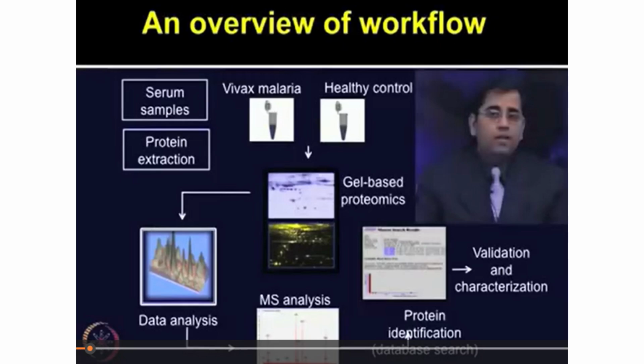You don't know exactly how much. You just know that that protein has a certain molecular weight and this specific protein is present. But still you cannot exactly say that it is the same protein which I am thinking or supposing.